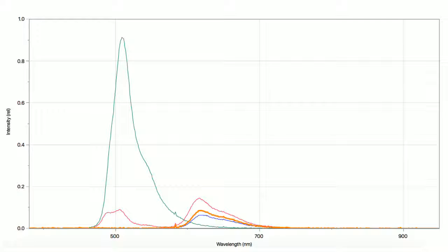Let it also be noted that the mixed sample having a peak in the red spectrum of higher intensity than the peak in the green spectrum is because, when the molecules are mixed, green dye molecules and red dye molecules both absorb energy from the activator and emit photons, but some of the photons emitted by the green dye are low enough energy to be absorbed by the red dye, and this lessens the green dye's intensity. The reason this doesn't happen vice versa is because the red dye's photons are too low in energy to be absorbed by the green dye molecules, as energy levels are quantized, except for some extreme cases that happen far too infrequently to have significant impact.